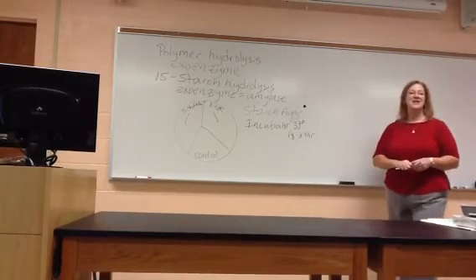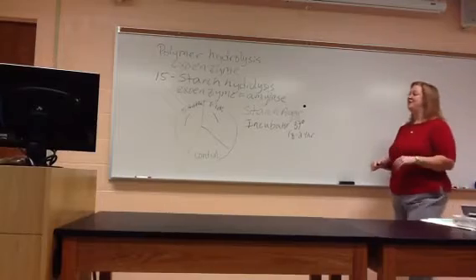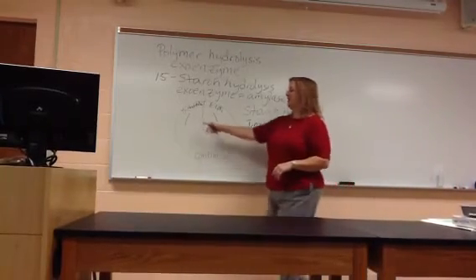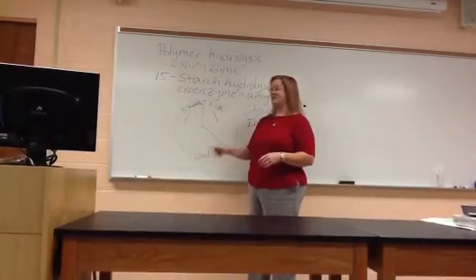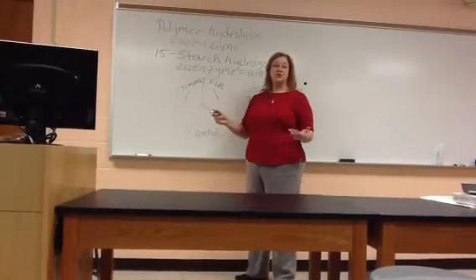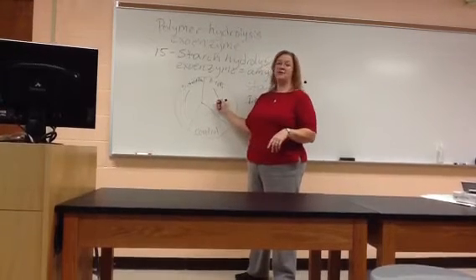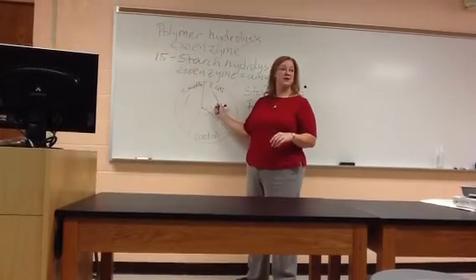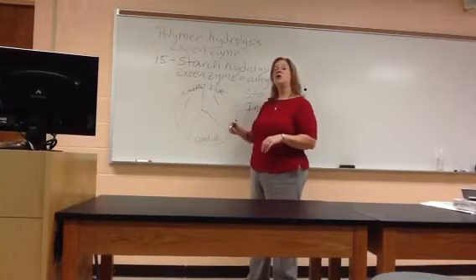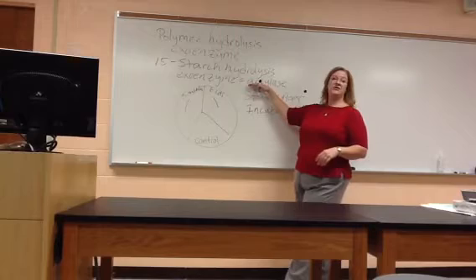Good. And while they're in there, they're going to grow, right? They're going to go through binary fission. So when we come back next week, you're going to be able to see the line where Bacillus is and the line where E. coli is. But let's assume for a second, we're just doing this hypothetically. Let's pretend that E. coli is the positive. I don't honestly remember which one's positive. When they're in the incubator, if there are positive bacteria, they're producing amylase.